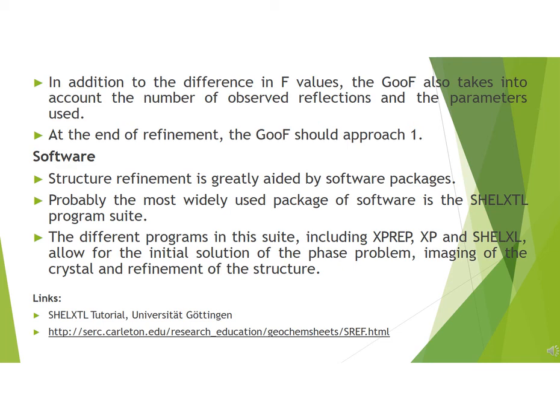Software. Structure refinements are greatly aided by software packages, and the most widely used package is SHELXTL. This suite includes different programs like XP, XPREP, XS, XL that are used for the initial solution of phase problems, imaging of crystals, and the refinement of the structure.